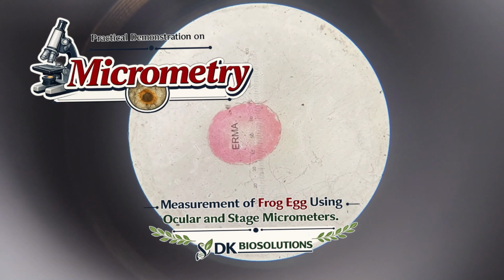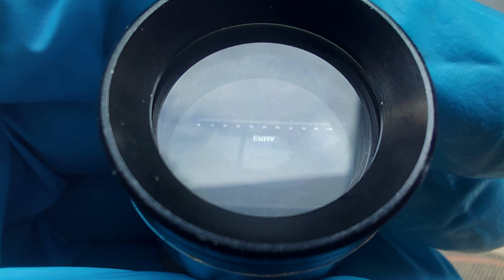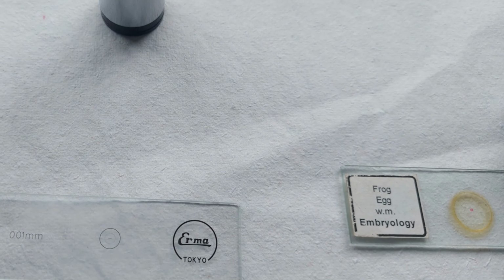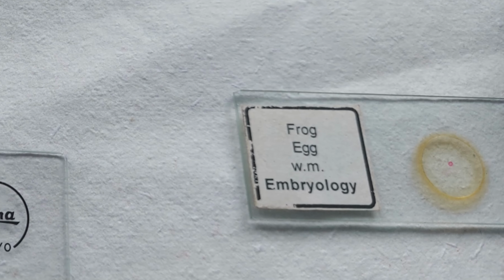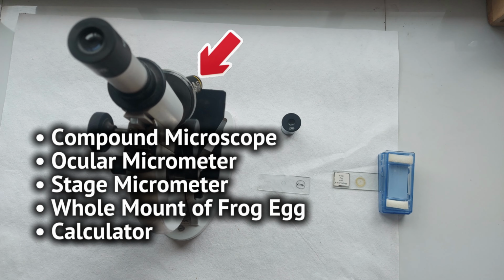Welcome to this practical demonstration on micrometry. In this experiment, we shall calibrate an ocular micrometer using a stage micrometer and subsequently determine the diameter of a whole mount of frog egg taken as a representative microscopic specimen. The materials required for this experiment are a compound microscope, an ocular micrometer, a stage micrometer, a whole mount of frog egg slide, and a calculator for performing calculations.